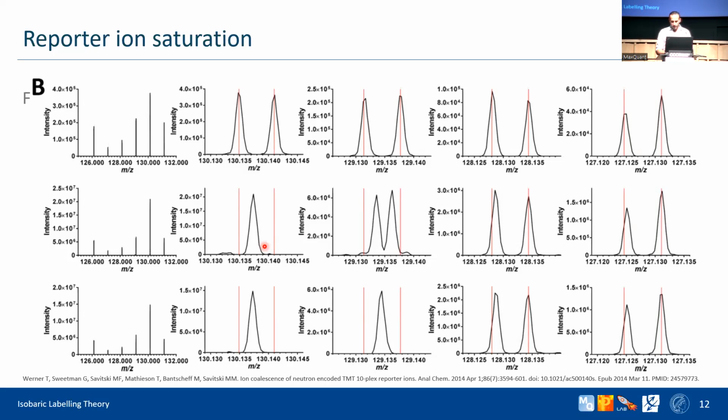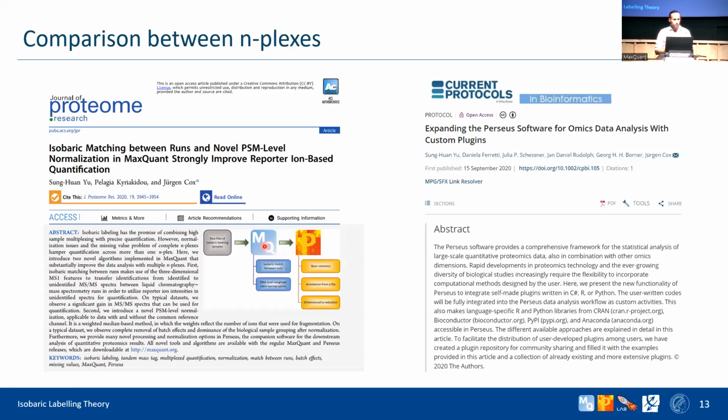Okay, final thing. Now we want to compare between different n-plexes. There are these two publications which you can refer to, where we talk about the approach that we have in MaxQuant and in Perseus for comparing with confidence between n-plexes.